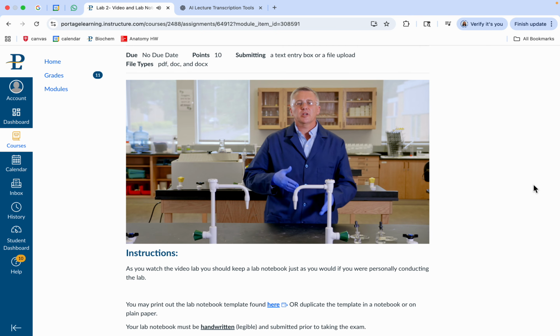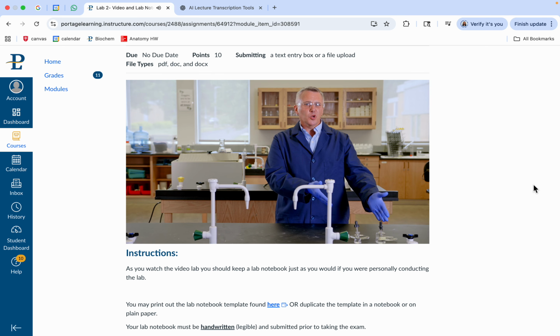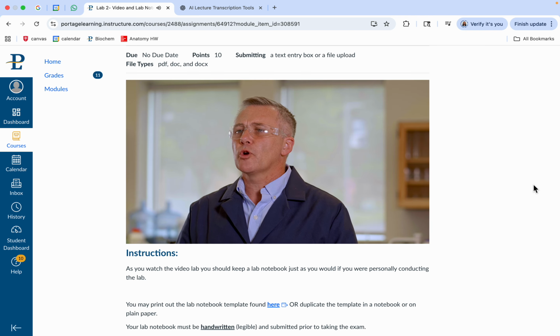So the goal of this part was just to get us to think about viscosity, how substances resist flow. And again, we want to correlate this to the intermolecular forces. We know that water and glycerin both have hydrogen bonds, but they had fairly different viscosities. Glycerin's flow is really slow. Water flowed relatively quickly. So we might want to think about what the difference is, because they both have hydrogen bonds. Now we're going to use this idea of viscosity in the next part to look at this a little bit more quantitatively.